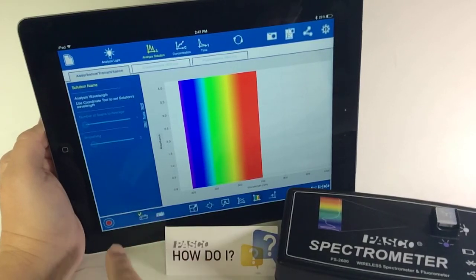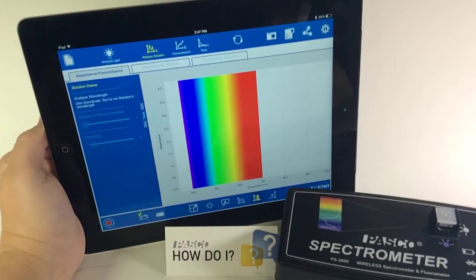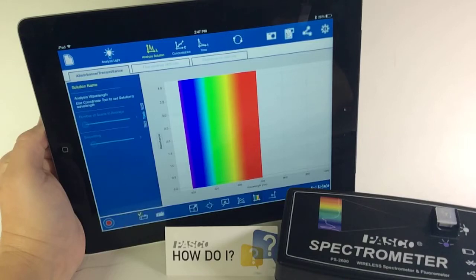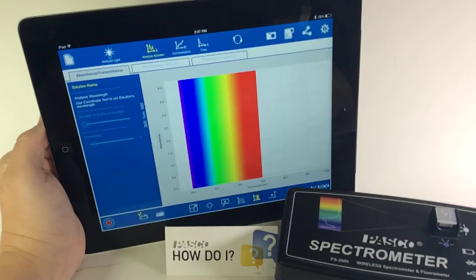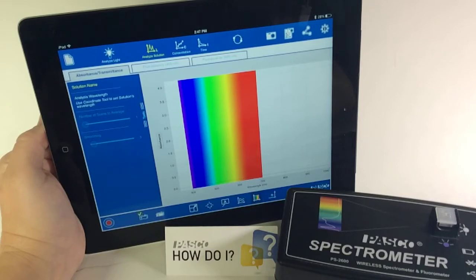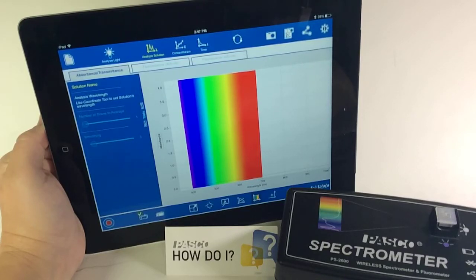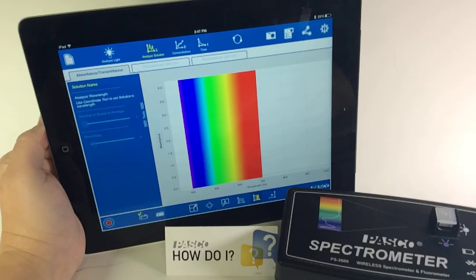I'm going to allow the light within the spectrometer to warm up. The light turned off during the Calibrate Dark procedure, and then it automatically turns on following that calibration.